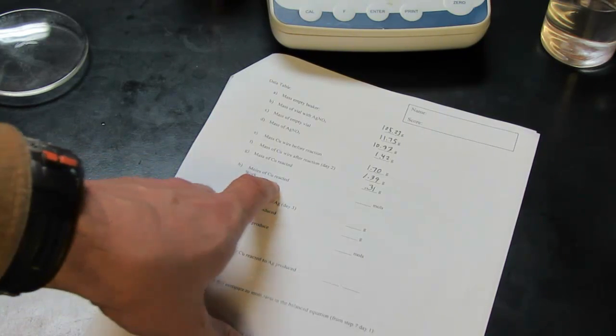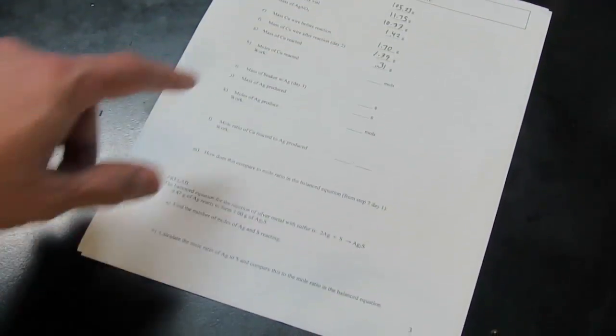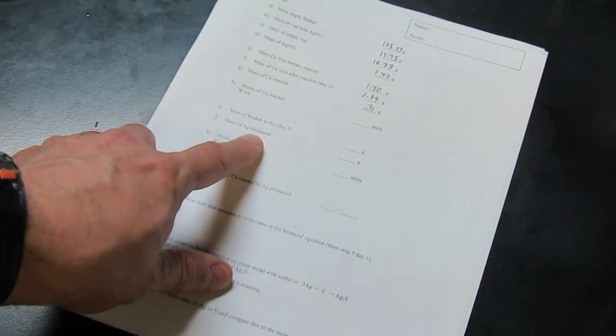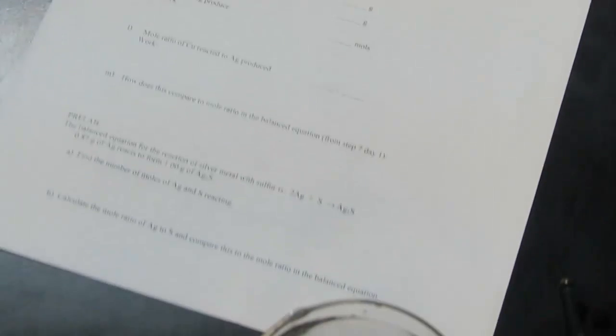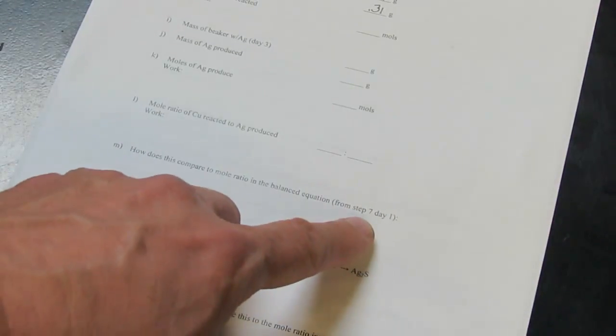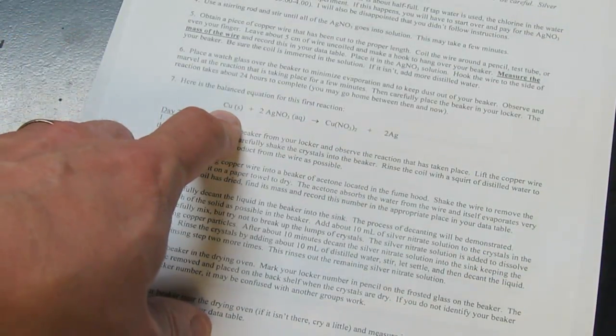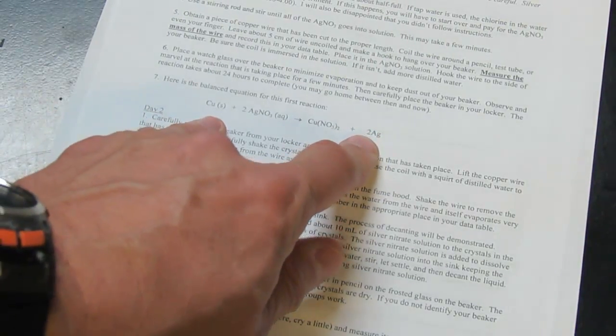And then of course we can convert that to moles of copper that reacted. And then when we come back next time we'll be able to find the mass of the beaker with the silver in it. And after that we'll be able to find the amount of silver that was produced and convert that to moles. And we're going to get a nice pretty mole ratio. And we're going to compare that mole ratio to the balanced equation from step seven in day one. The balanced equation should say one mole of copper reacts for, or produces two moles of silver. So we're going to see if we get that one to two mole ratio.